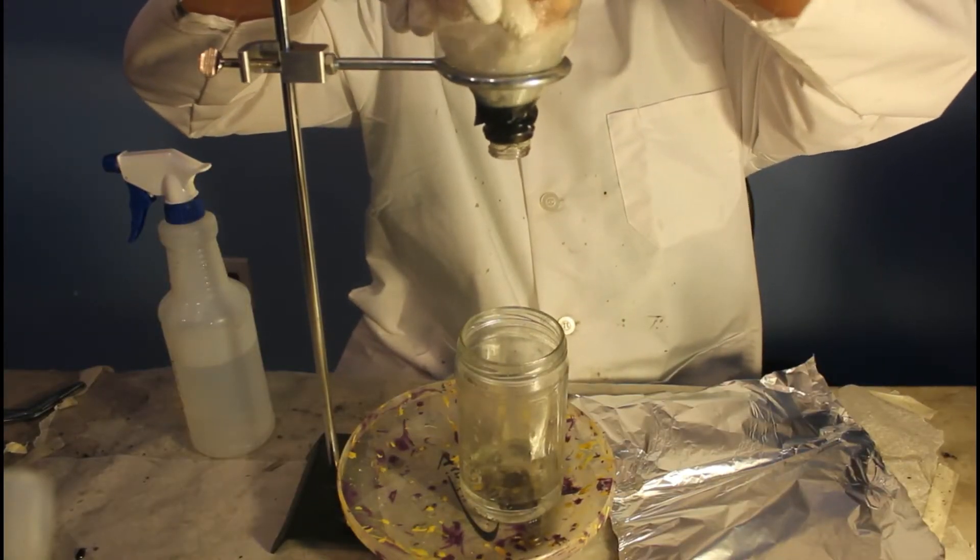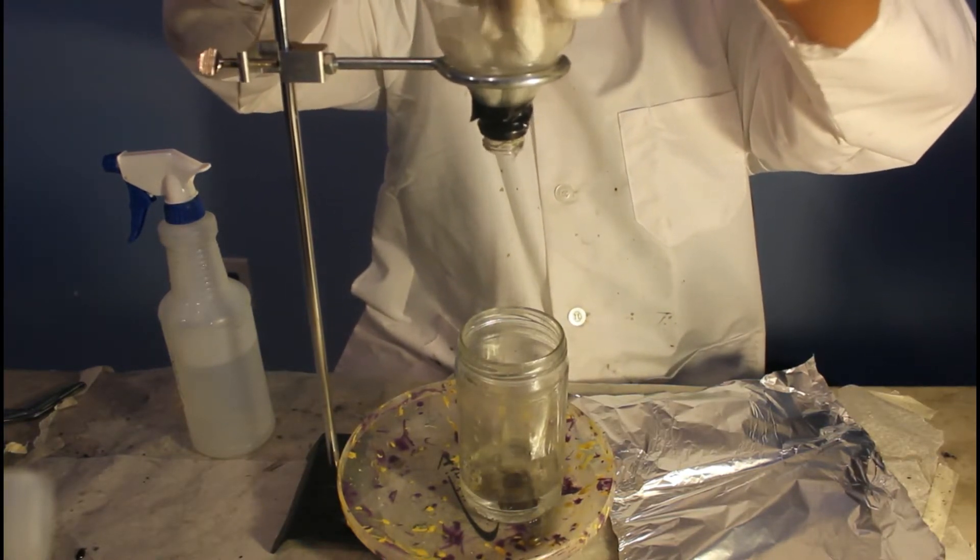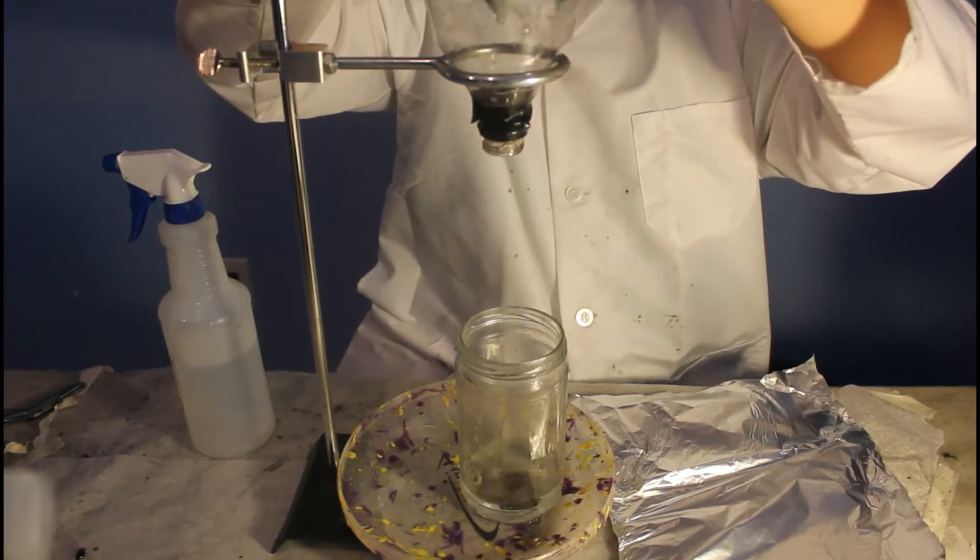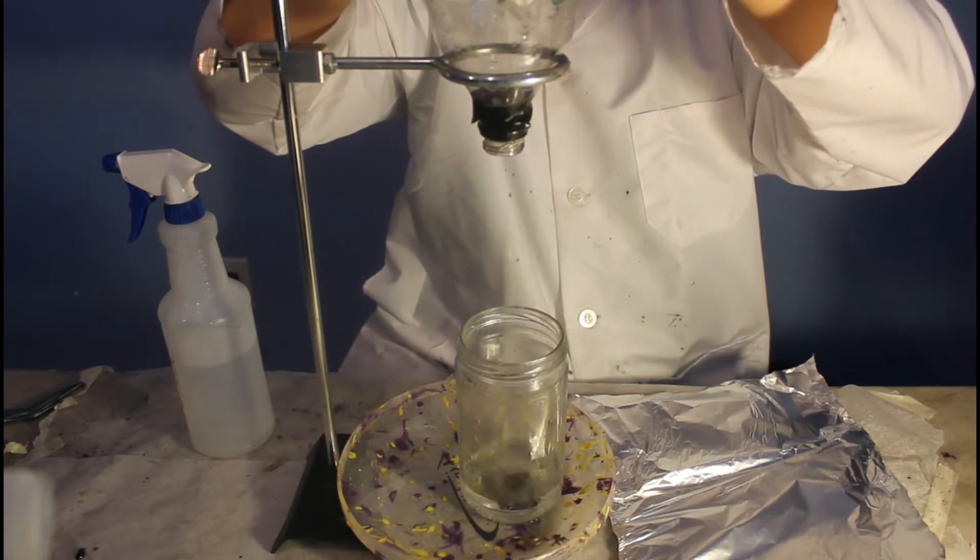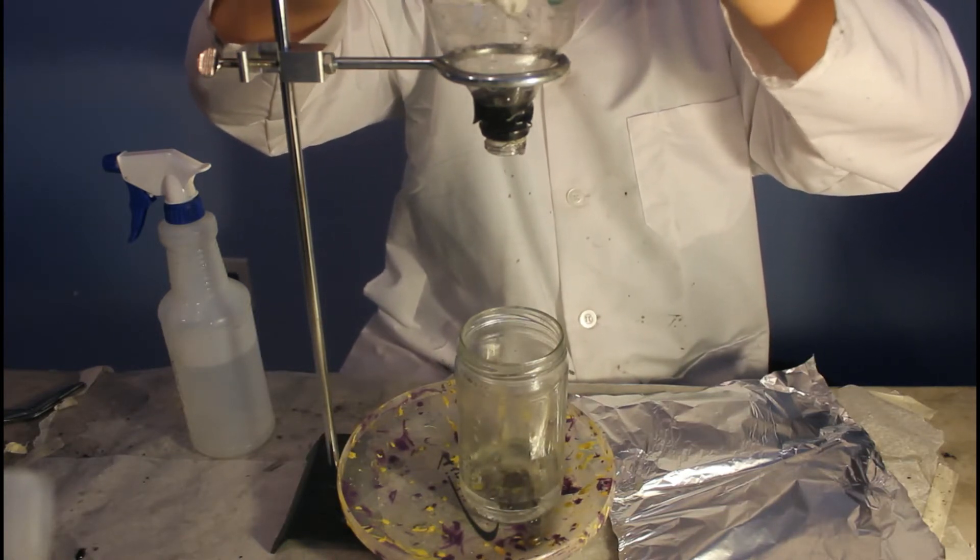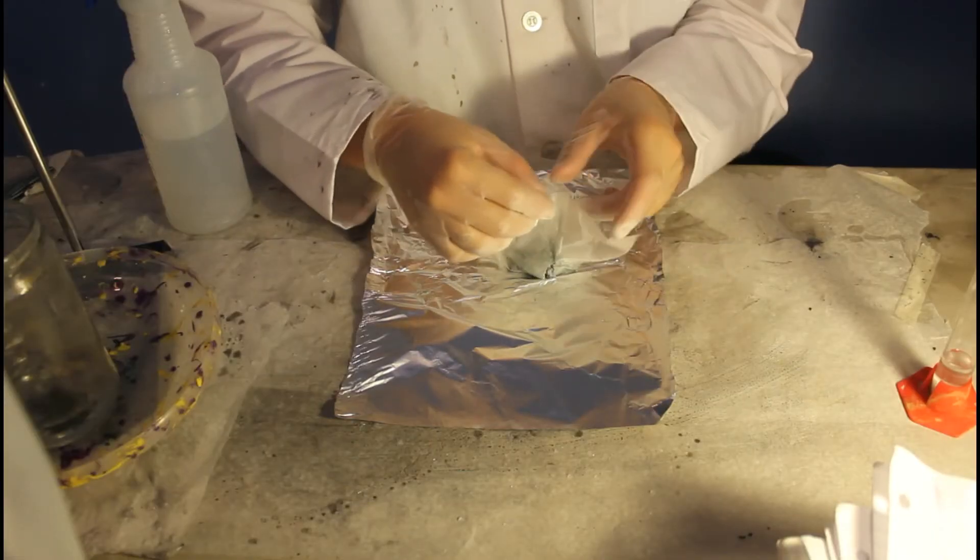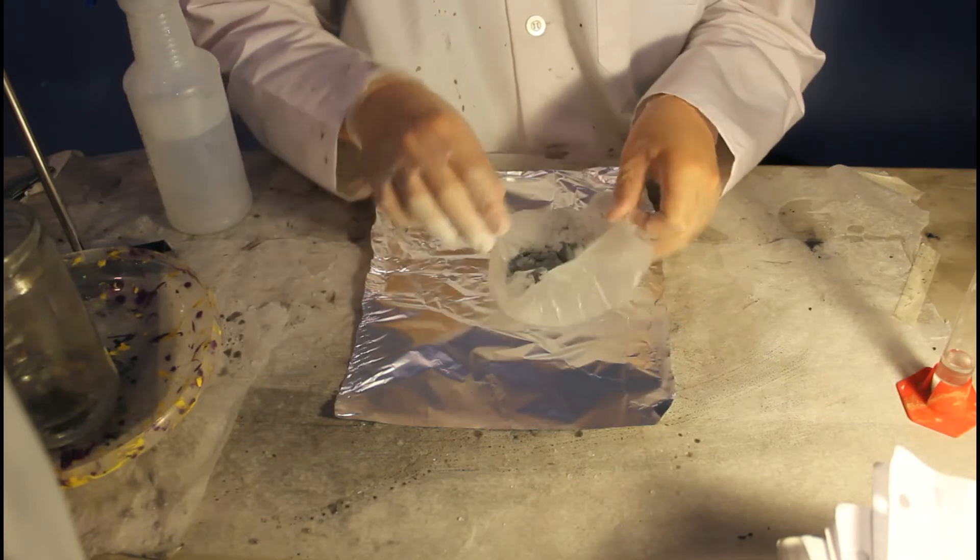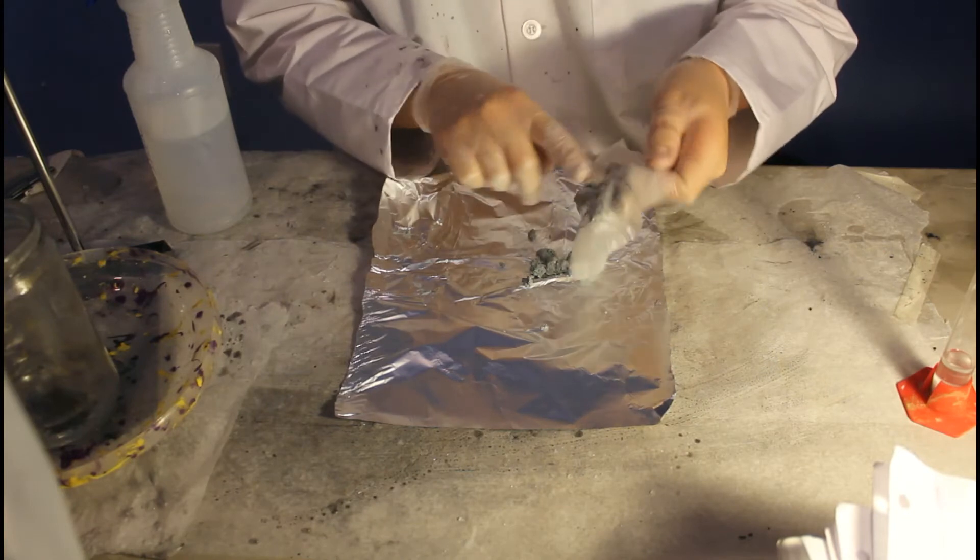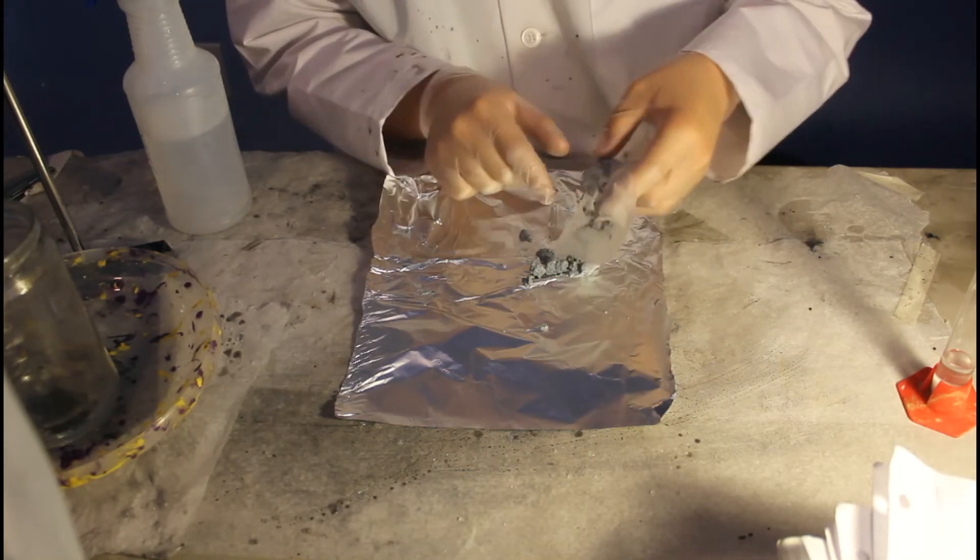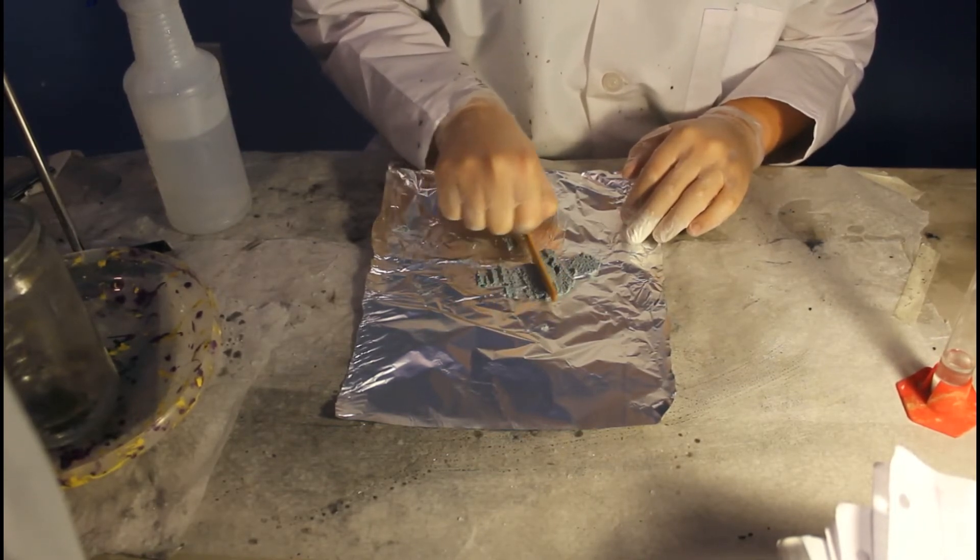After all of the water has passed through the filter, the filter paper is removed. The powder is squeezed to remove as much of the remaining water as possible and it is set out to dry on a piece of aluminum foil. As much zinc as possible is removed from the filter paper and transferred to the foil. The zinc is spread as thinly as possible on foil with a wooden stir rod. This will help it dry faster.